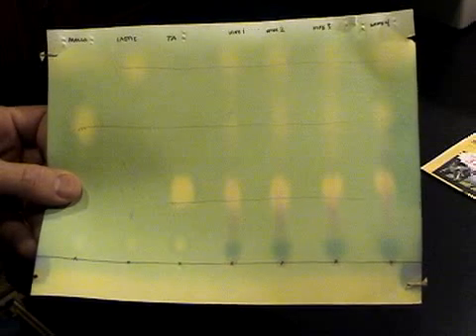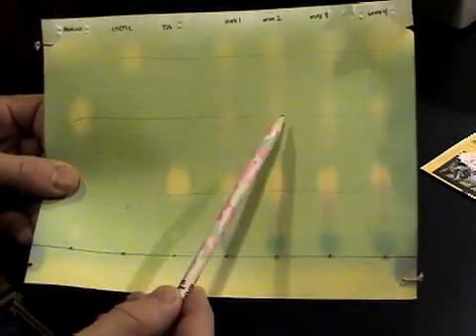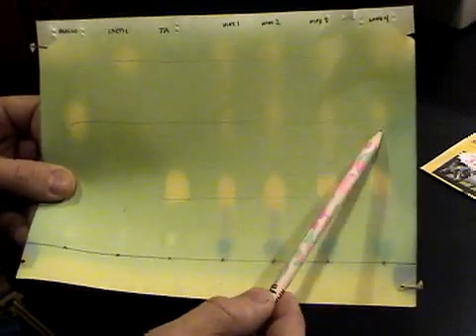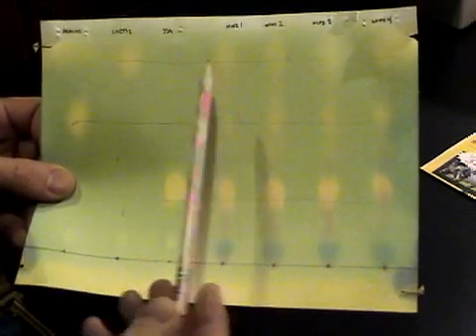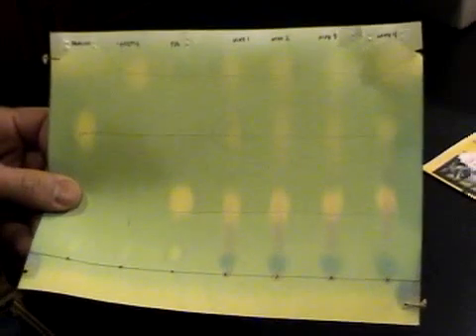I'm going to follow up in about two or three weeks with another test. The idea is the dots will be either not there or very small for the malic acid, and the dots up at the top will be larger, meaning lactic acid. Basically in the MLF, the malolactic fermentation, the malic acid has been converted to lactic acid. So we're waiting to see this area of color disappear in our next test. And that's it.